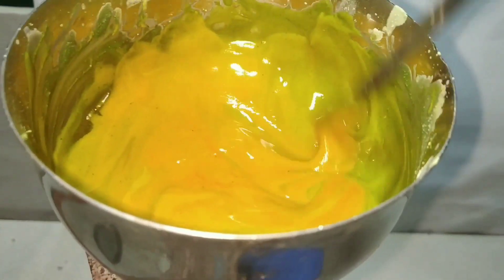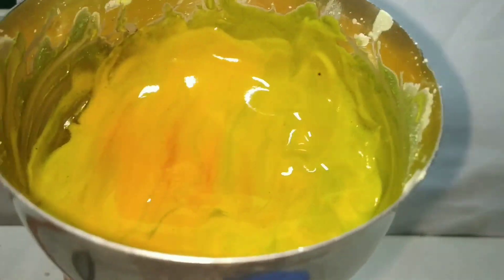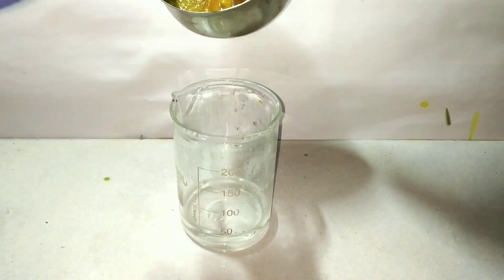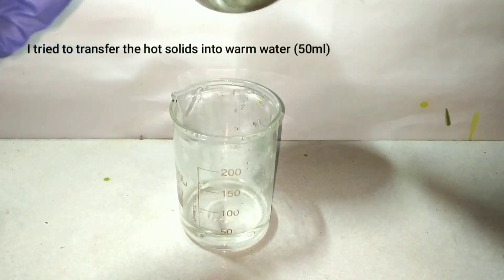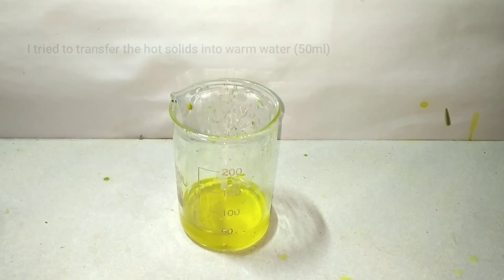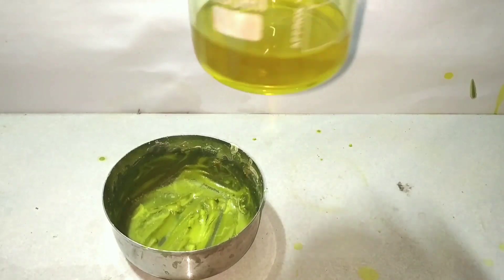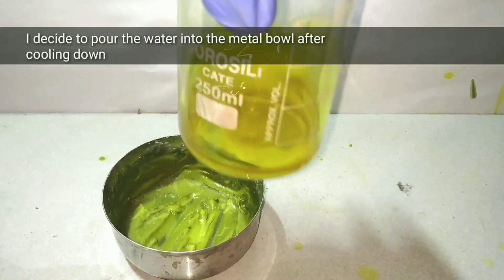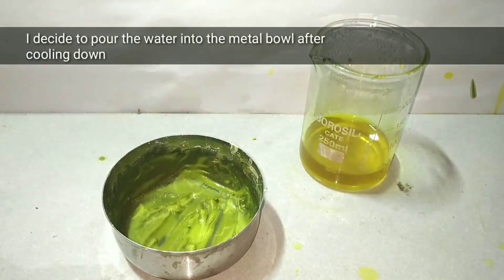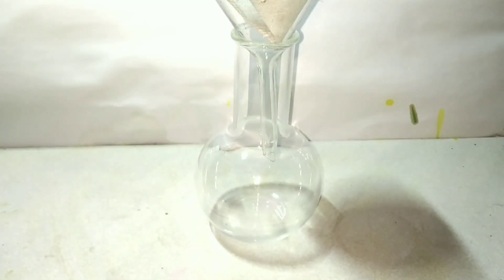Here I have done a tiny mistake. Even though it seemed like it cooled down, it was pretty warm which I did not notice. I transferred the solid into warm water and it resulted in a splash. So I decided to let it cool completely, and after cooling I poured the water into the metal bowl and washed everything off into this beaker. After washing I got a dark solution which contained some oxides and unreacted debris which I had to filter.